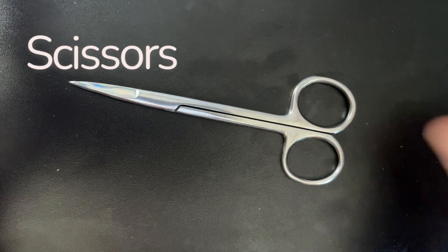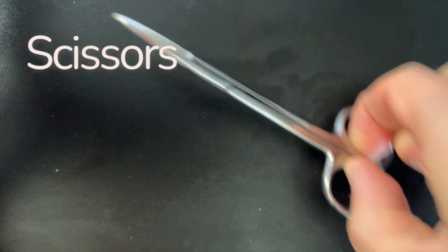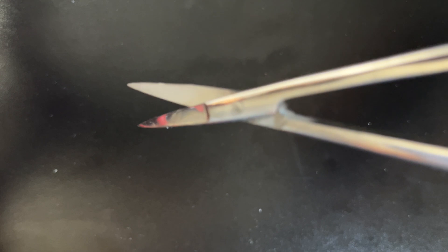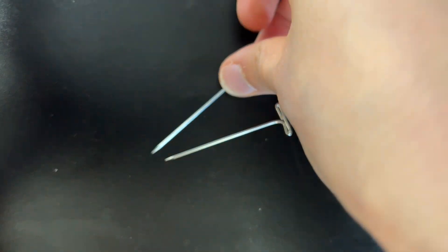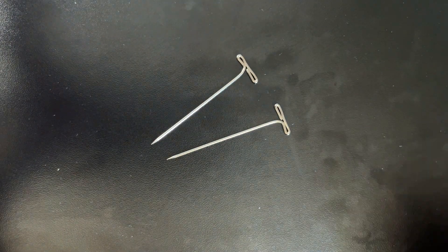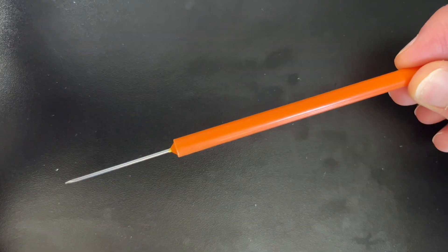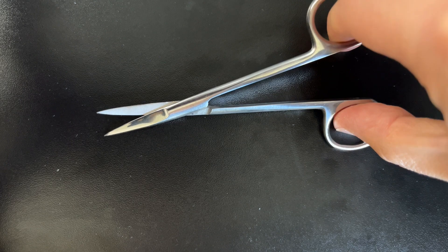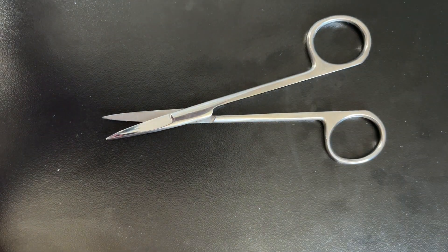Next, we have our small dissecting scissors. These are used to cut skin, fascia, and other smaller tissues. Remember, with any sharps in the lab — pins and the dissecting probe included — you always want them pointing away from you to avoid piercing your gloves or your skin. You'll probably use these more often than your scalpel in most of the dissections you'll do in a biology lab.